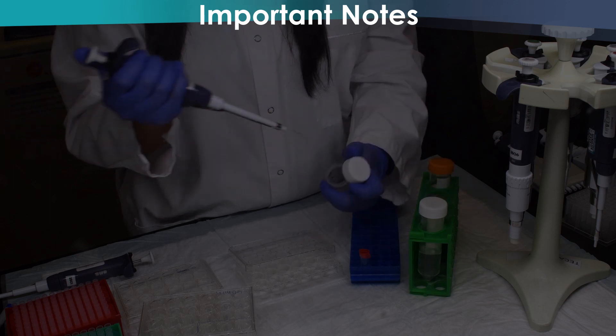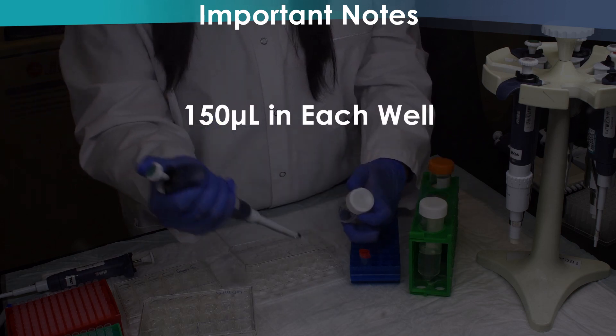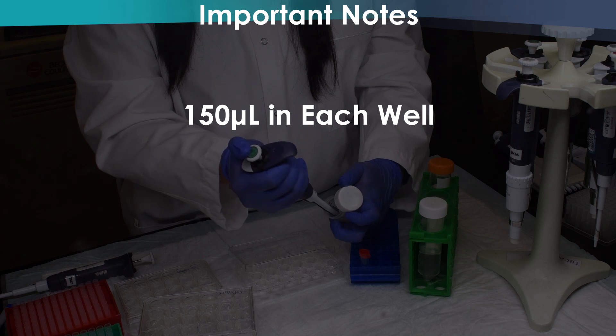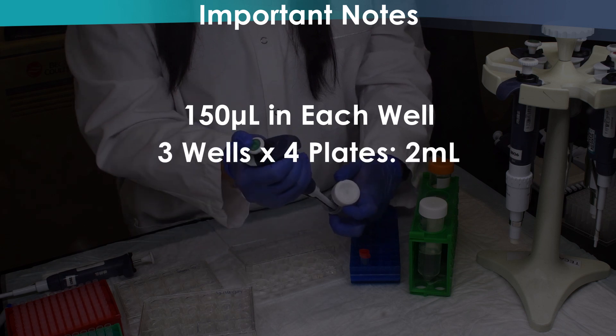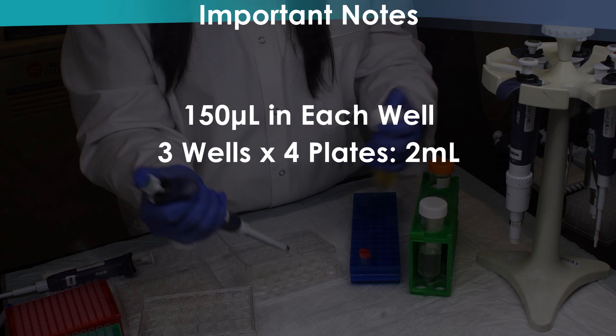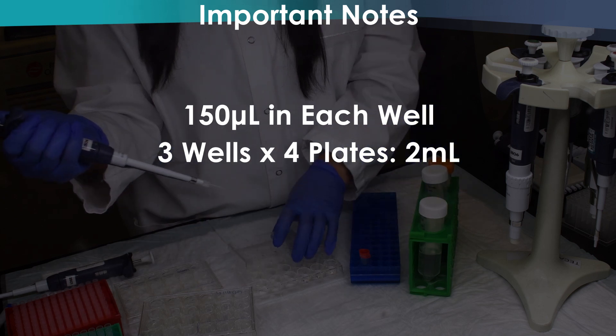You will want to dilute enough test article to be able to load each well with 150 microliters of test article in incubation medium. For example, if you have four time points with each treatment in triplicate, you will need approximately two mils of medium with test article.